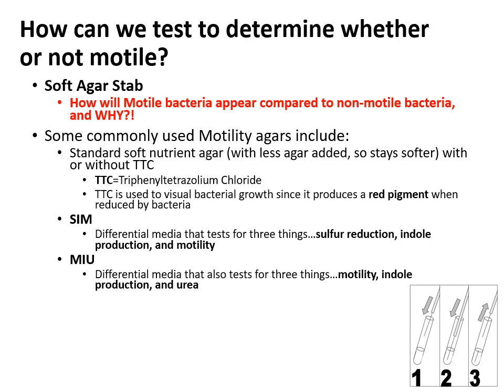So in addition to being able to see if your unknown bacteria can move on its own, you'll also be able to see some of its metabolic processes, which again helps you further characterize or identify the bacteria you're dealing with. So things such as sulfur reduction, indole, urea hydrolysis, the things that Enteropluri would test as well.